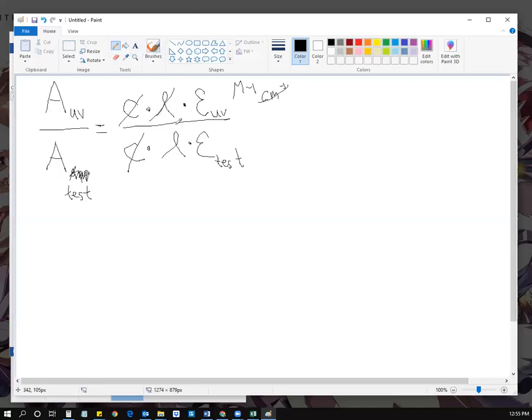And what we can do now is combine the extinction coefficient for the test tube for the DTNB and also its path length into one single extinction coefficient that we'll call the apparent extinction coefficient. And that will not have a path length or a per path length unit associated with it.